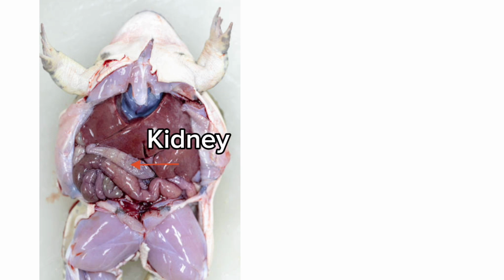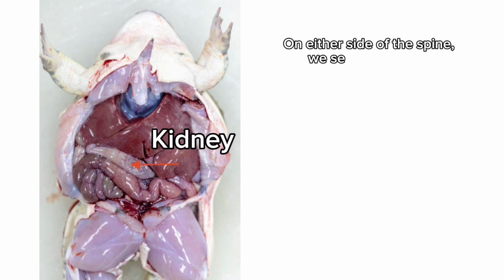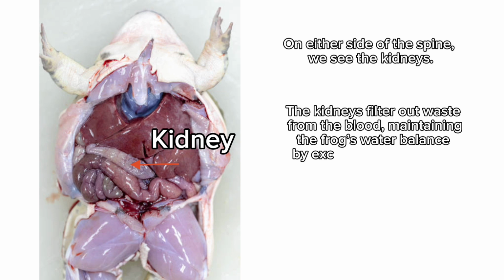Next, the kidneys. On either side of the spine, we see the kidneys. The kidneys filter out waste from the blood, maintaining the frog's water balance by excreting excess salts and water as urine. This is vital for survival, especially since frogs live in environments with varying levels of moisture.